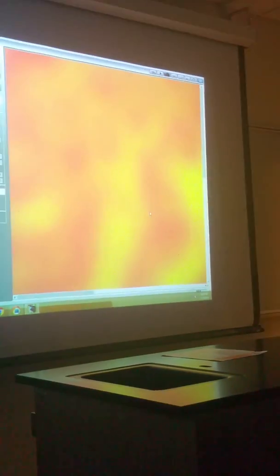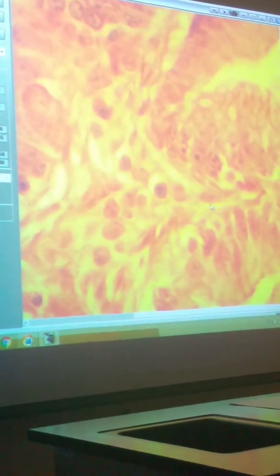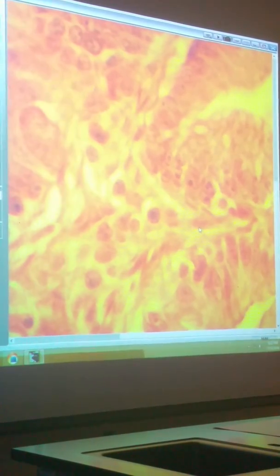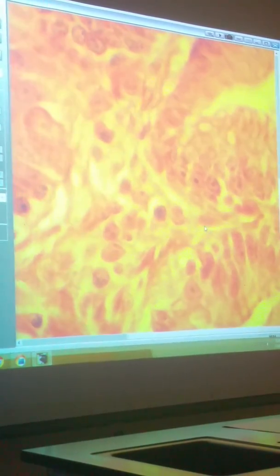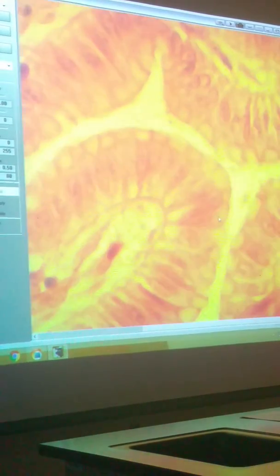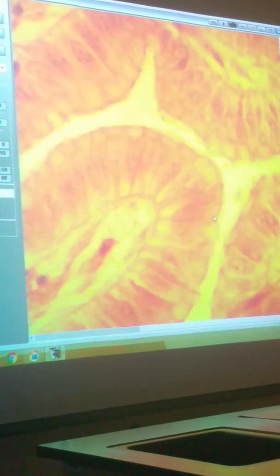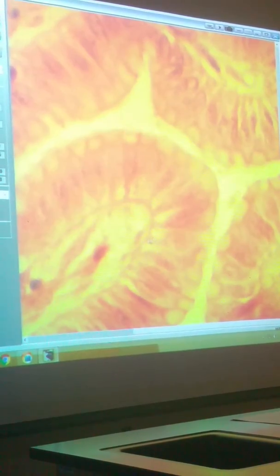All these circle ones are a bunch of gastric glands you see. The gastric pits are the white space, but it's out of focus. They're at the top near the lumen. What are the gastric pits? Okay, that's right here.